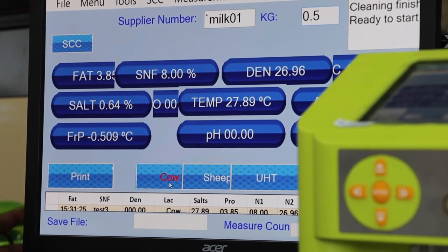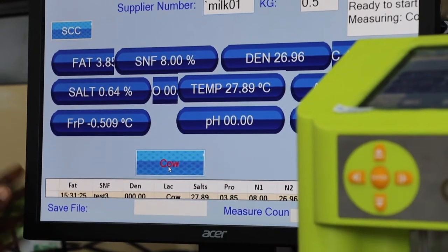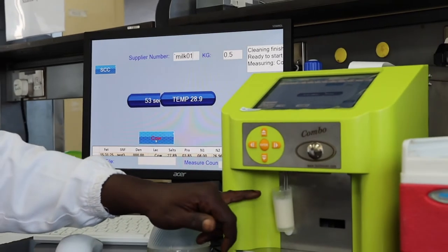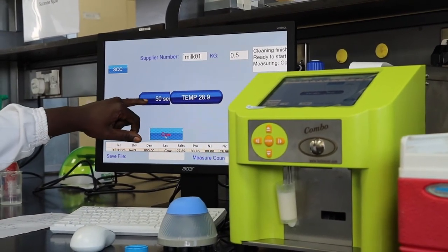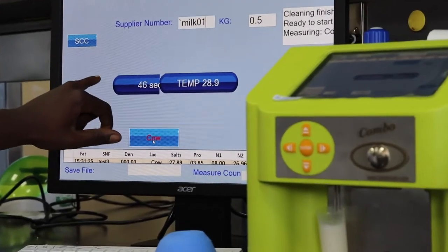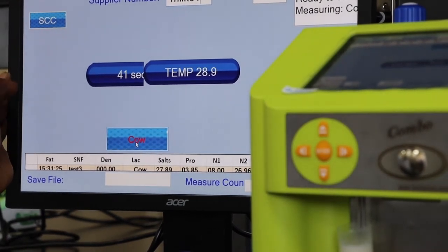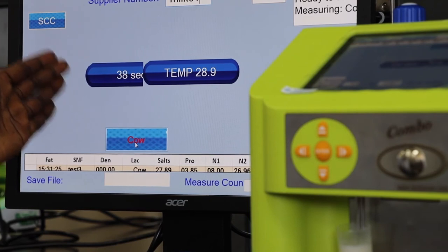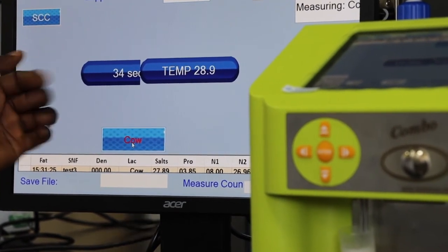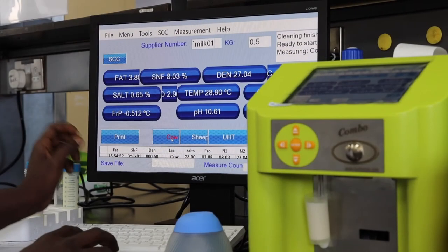Once you're ready, you hit the cow button, and as you can see the milk is aspirated through the equipment. Look at the monitor — it starts to count down the analysis runtime. Normally the analysis takes about 60 seconds, so within 60 seconds you will have your data ready. It requires a bit of patience for that one minute to pass before you get your data.